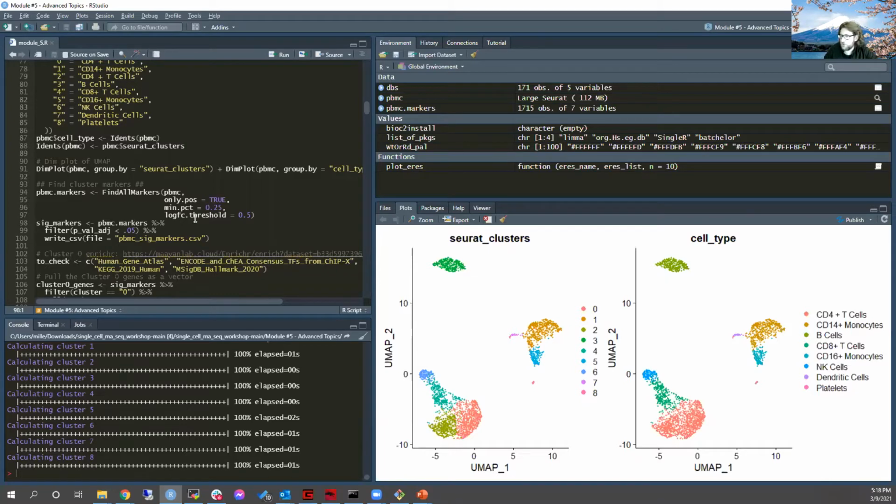I've learned my lesson. I'm not going to jump in too early this time. Okay, great. So Tyler says finding marker genes for all detected clusters. Yeah, exactly right. So these are the genes that are specifically, in our case, we're only looking for overexpressed. So these are the genes that are specifically overexpressed in each cluster compared to every other cluster.